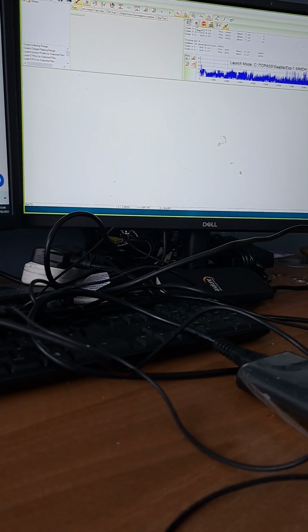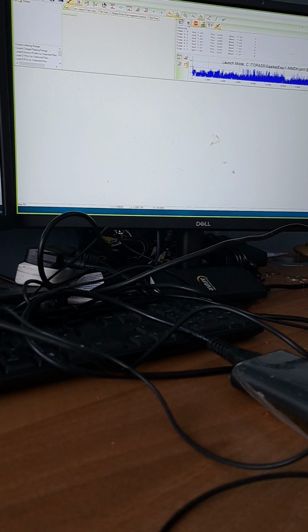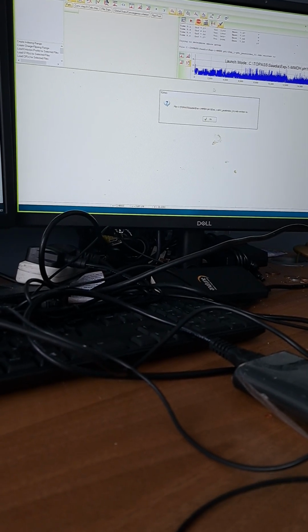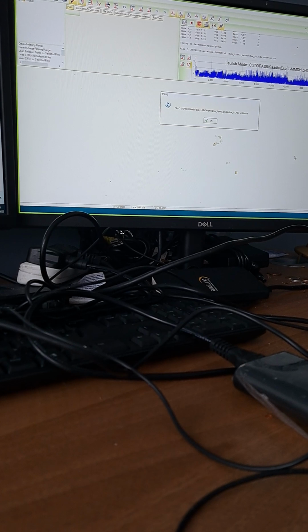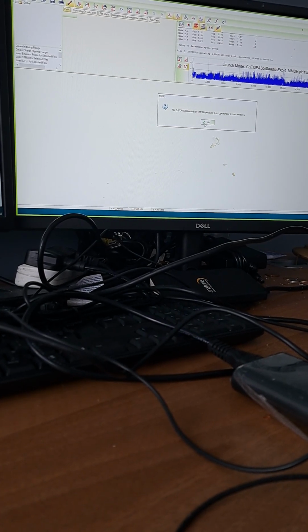Okay, so that's giving you an idea as to how things are going. You can see that the y-axis here is not getting above 6. That means that the solutions are unlikely to be good. Okay, fine. So we can just click on OK and then go back to JEdit.